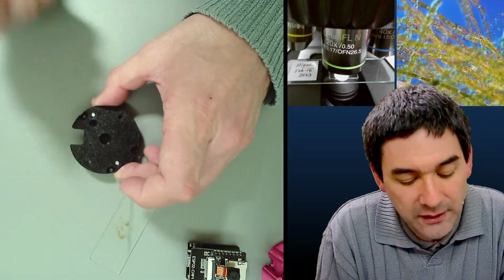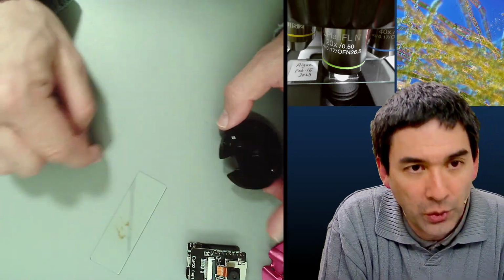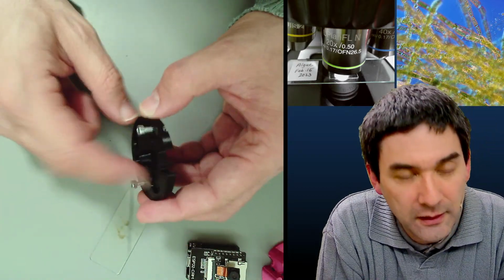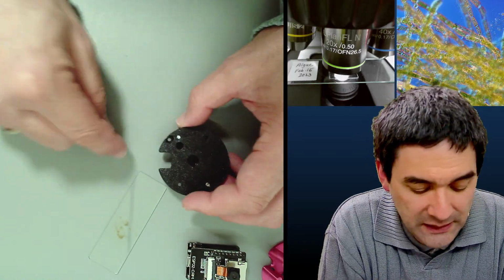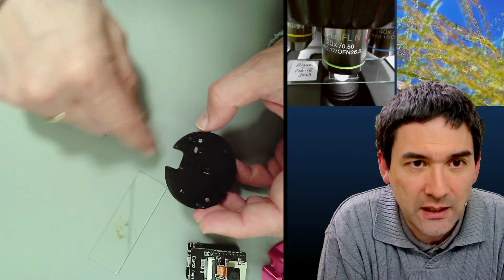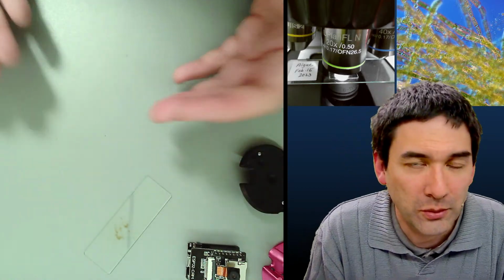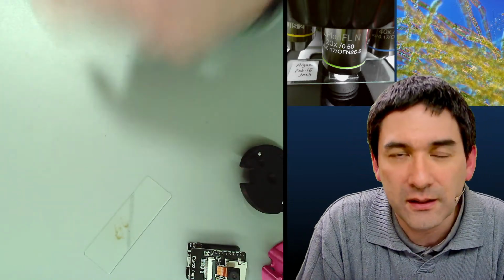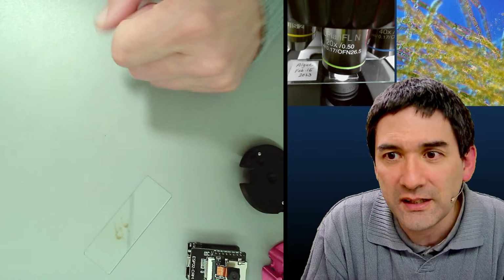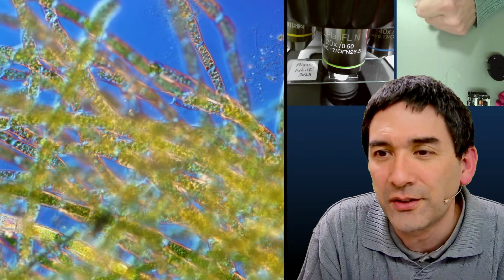Without moving it, then what you're going to see, hopefully, is a pattern of spores, because of the different lamellae which produce the spores, and then you basically have the different spores arranged in a nice pattern. And you can then use a stereo microscope or even a regular microscope to directly observe that. But that's a way of actually making the spores nicely visible. Let's go back here because this picture looks a little nicer.